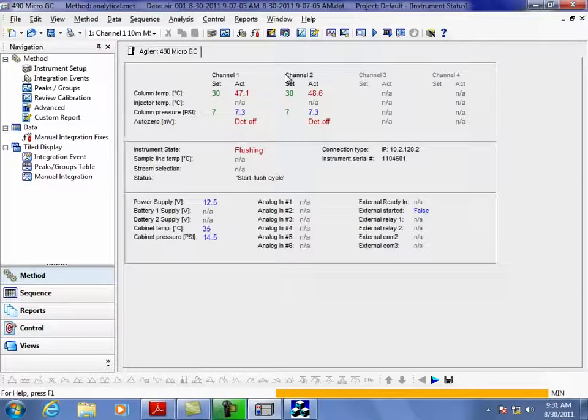And I've got a person trying to do just that with 10 mils out in California right now, and she's not getting reproducibility at all. Now, I think she may be doing something wrong, which is why I've got to go out to California in a couple of weeks. But I have a person at the USDA who has the configuration with the syringe injection like a septa in the front. On his system, I'm using about 5 mils of gas every time on a gas-tight syringe. But again, he's got very tiny capillaries coming from here up into the back and through a pressure pop-off that goes into the injectors.